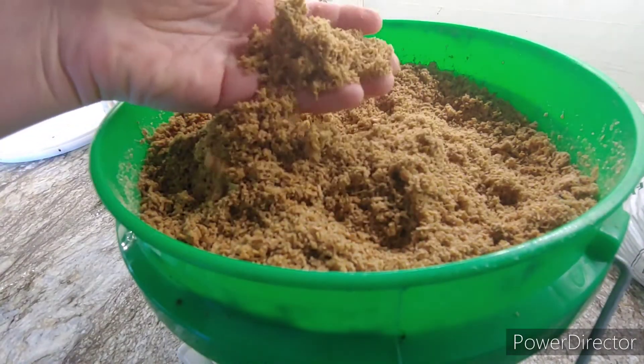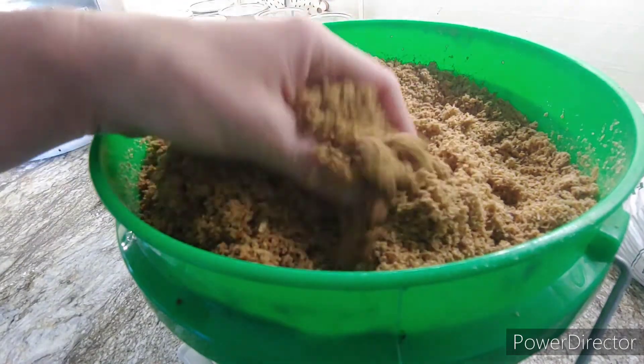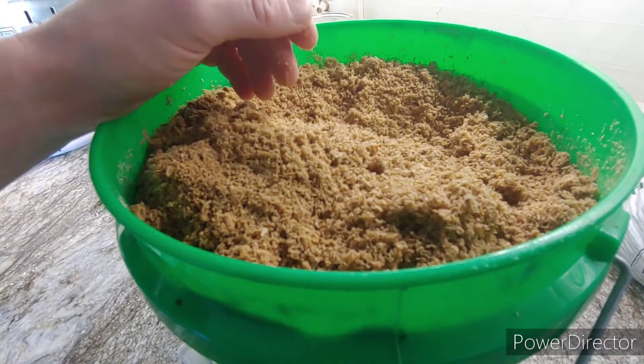So when you're done adding water to expand your pellets, this is what you're left with — it's just sawdust. This is damp sawdust, and before you can handle it or do anything with it, you're going to have to wait for it to cool.